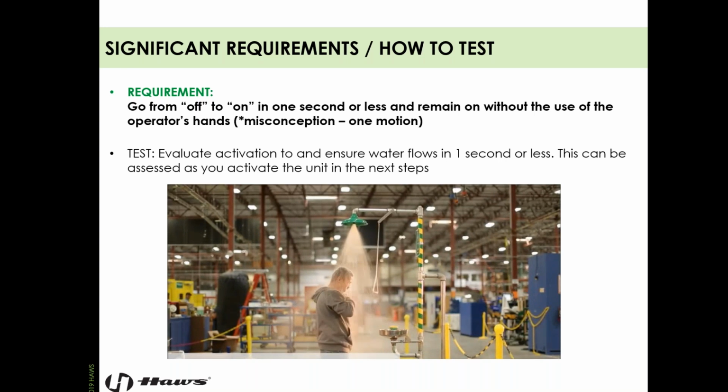Now, there is a misconception out there that it's one motion. That is untrue. According to the ANSI standard, it has to be activated in under 1 second, which can require maybe multiple actions to activate, as long as it can be done in under 1 second.